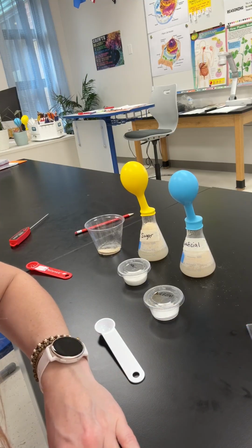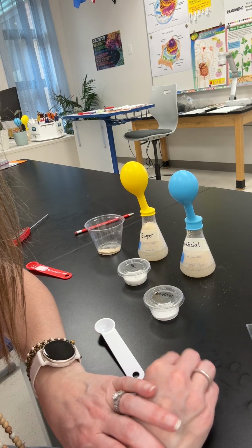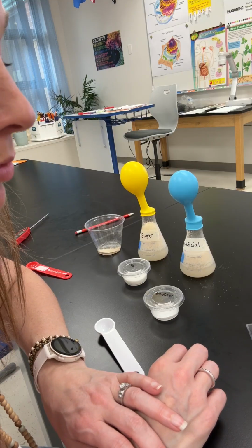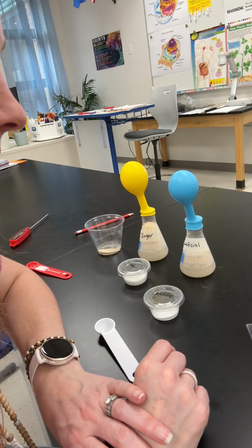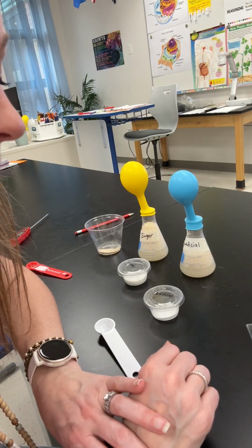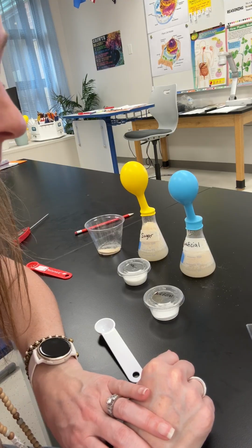Now after you have that data, add that data into your data table, and use that data table to create a graph. Think about what the independent variable is, what the dependent variable is, and then set up your graph. If you are absent and you are struggling, I want you to at least attempt it, and then when you get back, come talk to me and I can help. I can look over it before you turn it in, to see if you need to make any corrections.